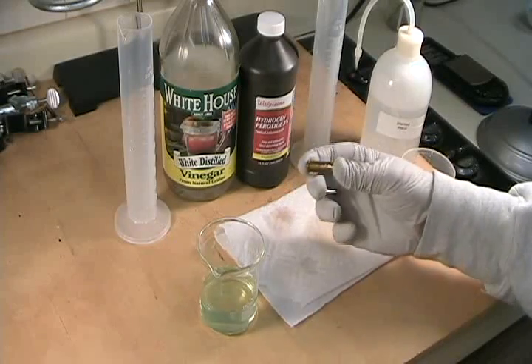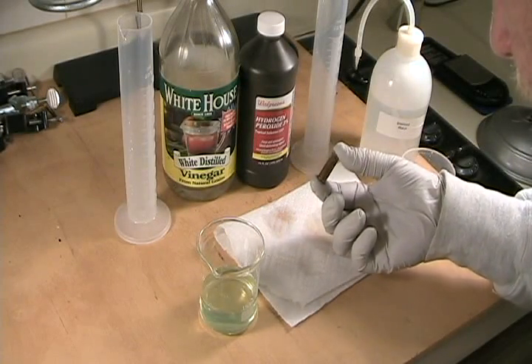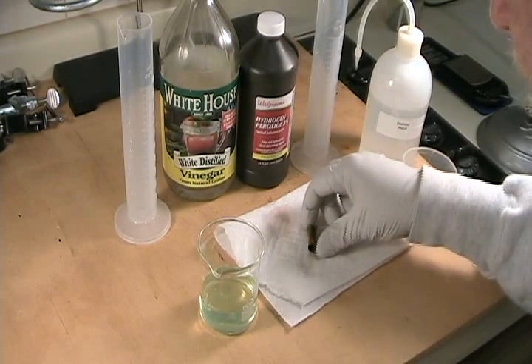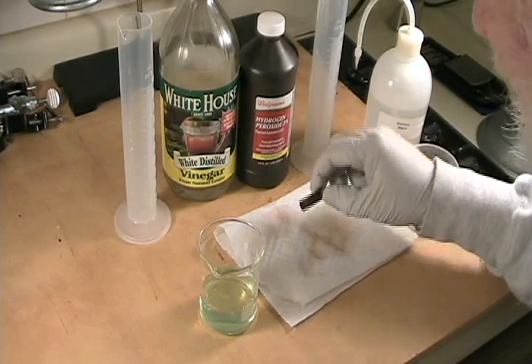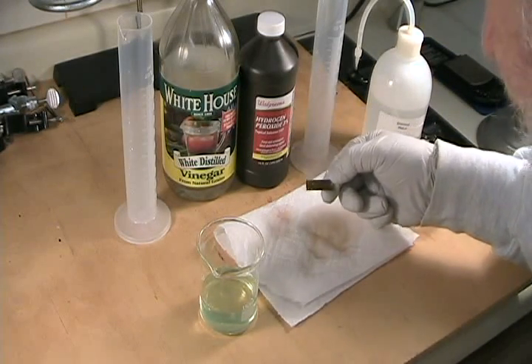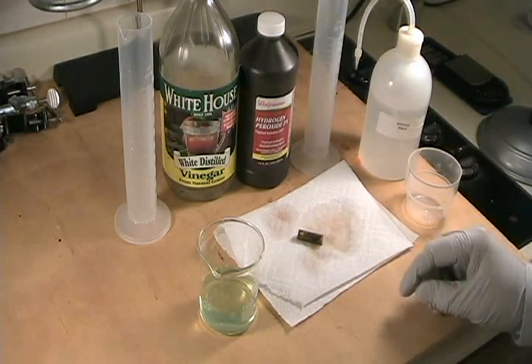We have some very nice ridges on the cartridge case. That's obviously a partial thumbprint, and on the other side we have a partial fingerprint. So that's all there is to it.